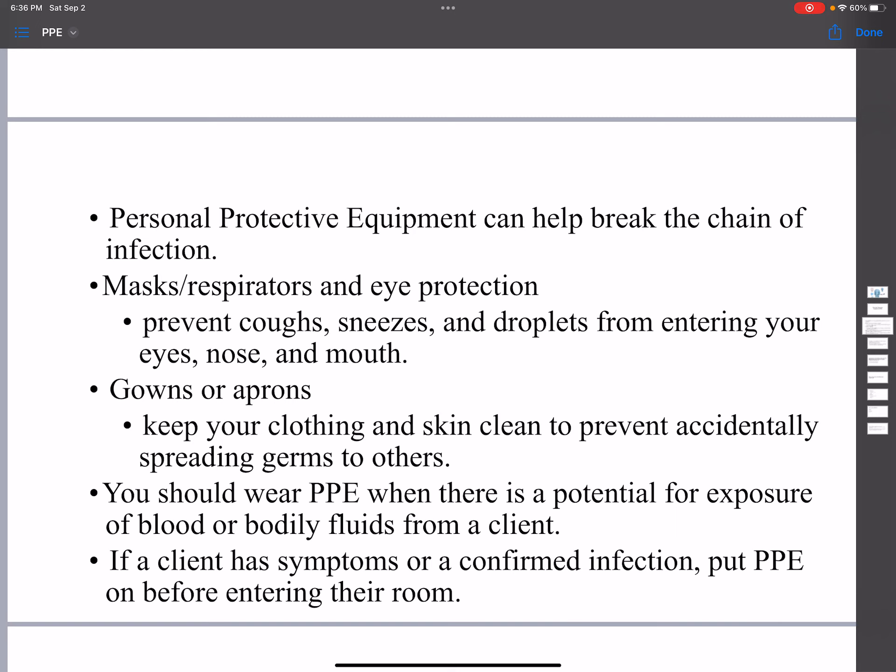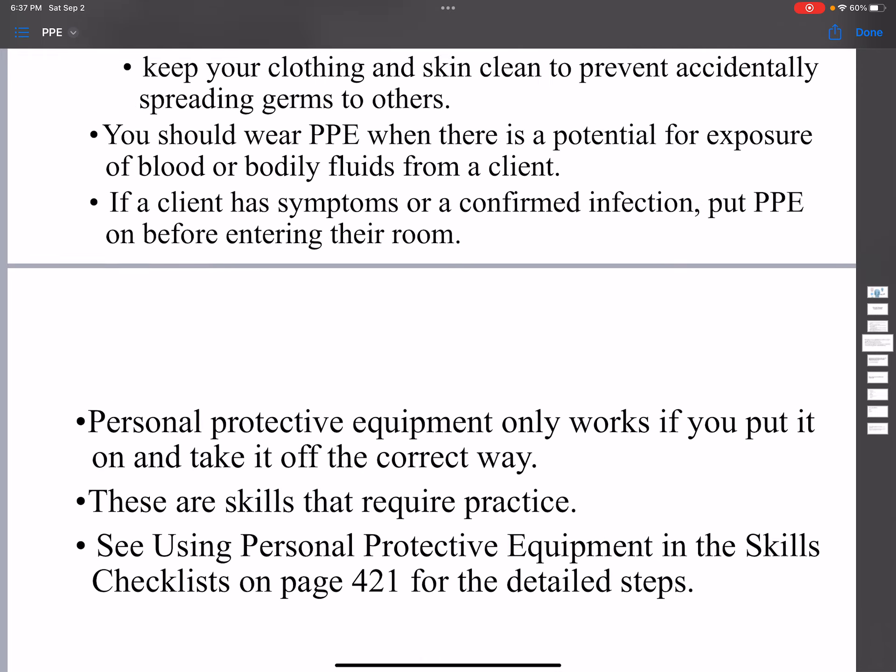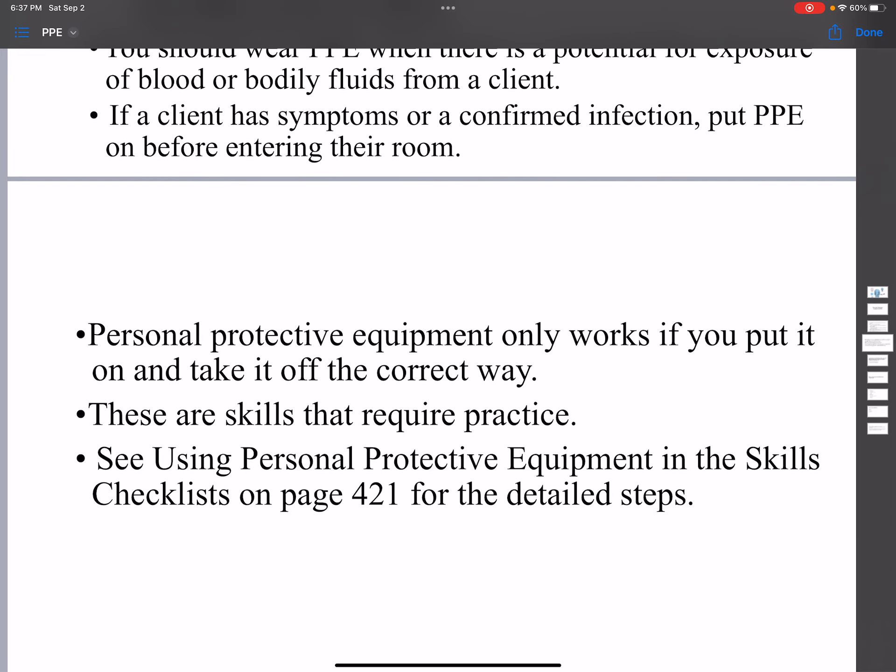You should wear PPE when there is a potential for exposure to blood or body fluid from a client. If a client has a symptom or a confirmed infection, put PPE on before entering the room.